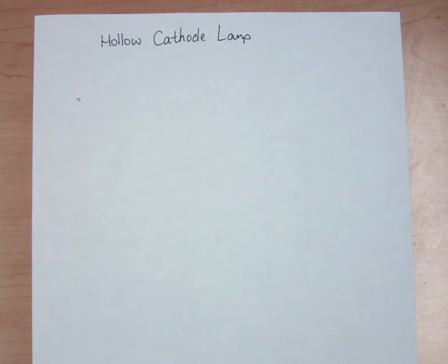When we consider atomic absorption and that we might want to use Beer's law with that, we need to consider that Beer's law says that we must be using monochromatic light, especially for quantitation. So when we're using a range of wavelengths coming from a radiation source, we want that range of wavelengths to be much smaller than that of the absorbing sample.